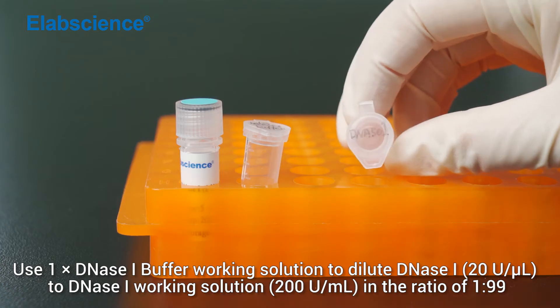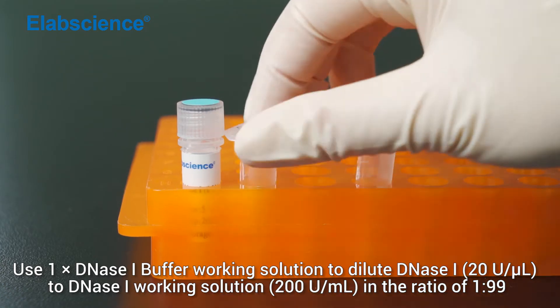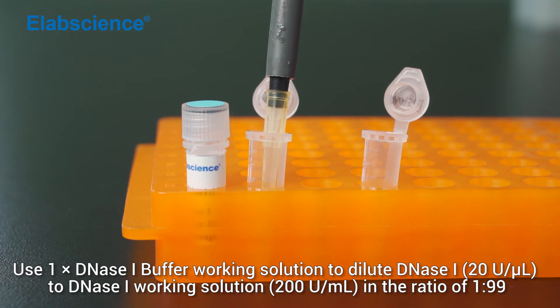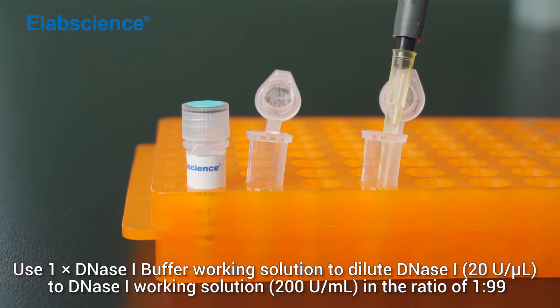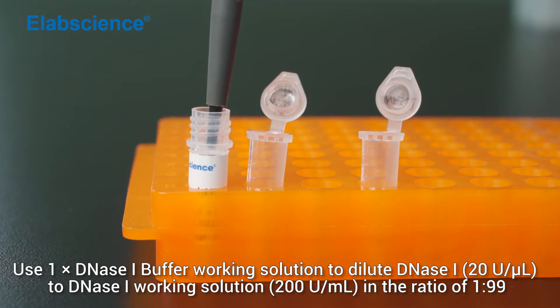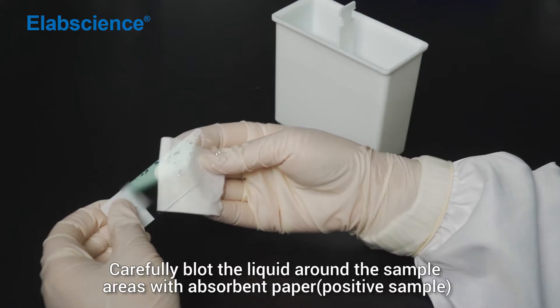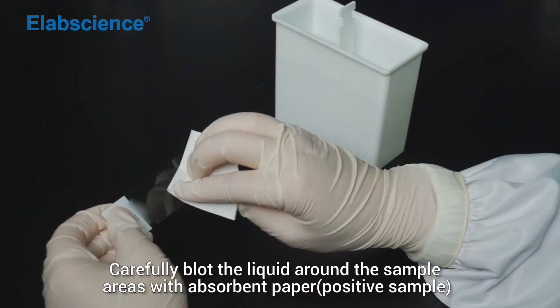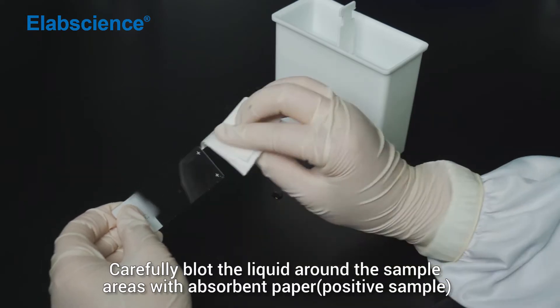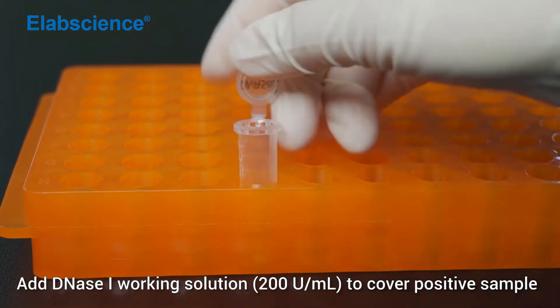Use 1x DNase I buffer working solution to dilute DNase I to DNase I working solution in the ratio of 1 to 99. Carefully blot the liquid around the sample areas with absorbent paper. Add DNase I working solution to cover a positive sample.